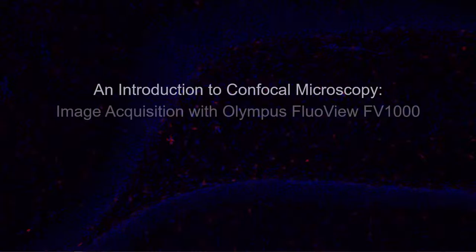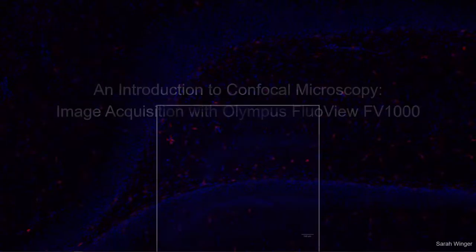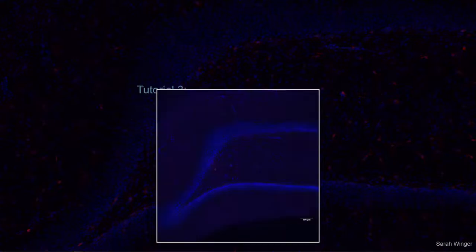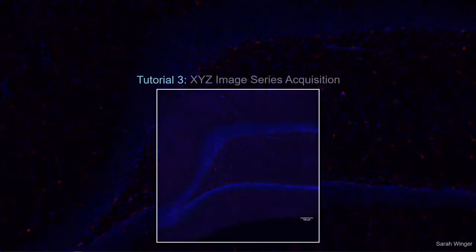An Introduction to Confocal Microscopy Image Acquisition with Olympus FluoView FV1000, Tutorial 3: XYZ Image Series Acquisition.